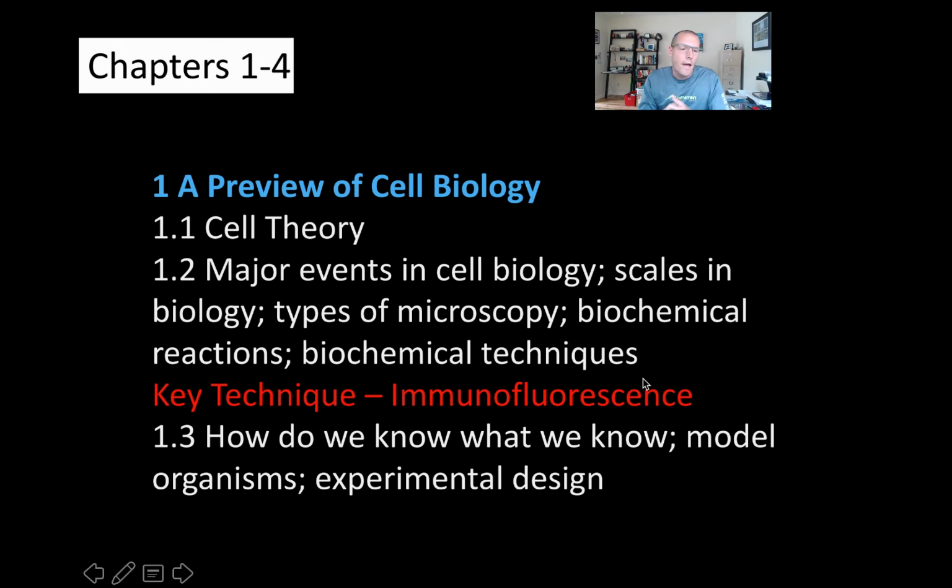Welcome back, and in this video we're going to take a look at one of the key techniques in cell biology, and that's immunofluorescence. We're going to look at a lot of these techniques because when you get onto 4,000 level classes and you are looking at data, it's important to understand how that data was generated and whether the technique that was used was appropriate for generating the data that's being analyzed.